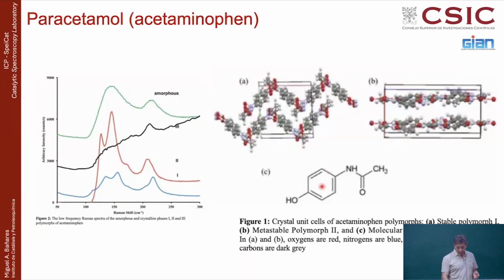And of course, the molecule, like a paracetamol molecule like this, will not expire, but it has several configurations, several isomers, and the crystalline structure will affect how efficiently it kills your headache. So basically they are looking at the different conformations, and there is a polymorph which is efficient and another one which is not efficient. You take it, I mean, it won't kill you, but it won't heal your headache either.